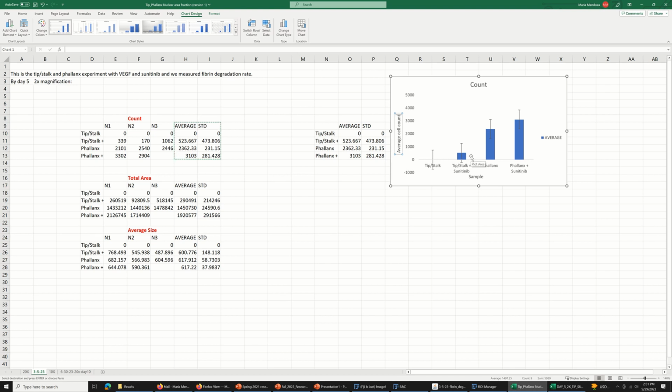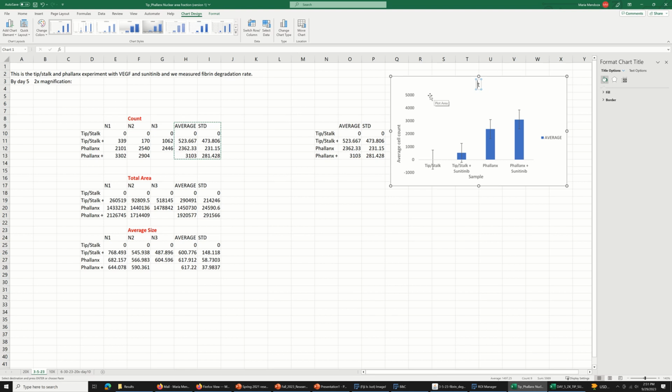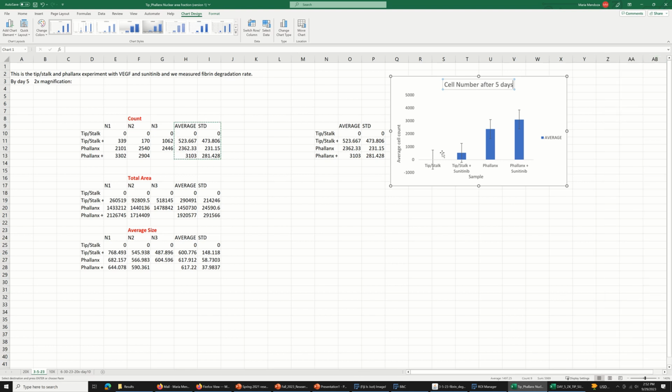Yeah, so this is gonna say cell count, cell number after 5 days, something like that. It's 5 days later. I'll go ahead and come up with the titles later, but basically this is all we want to do.